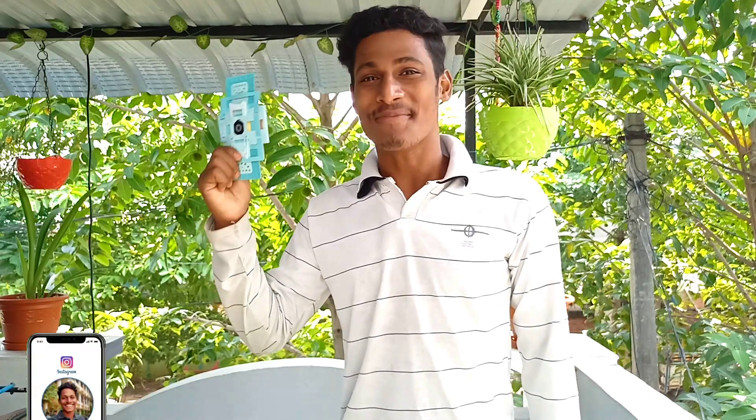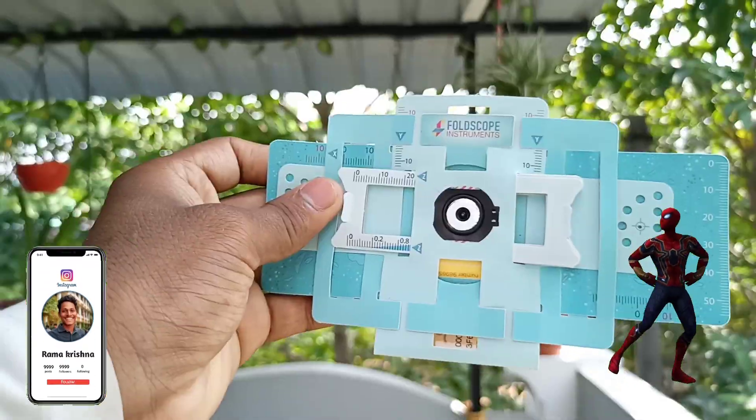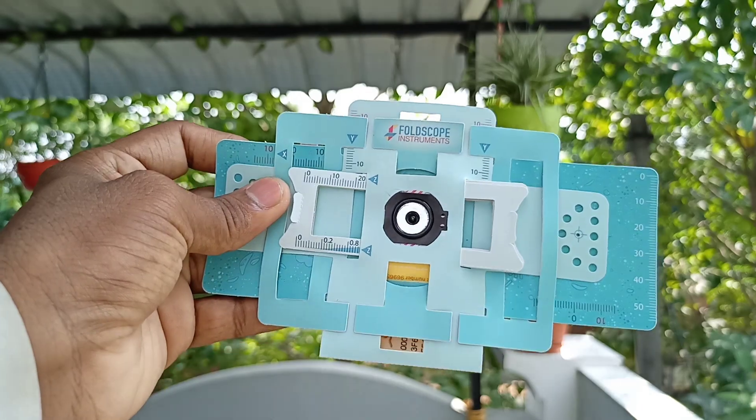The thing I am holding in my hand is a microscope — yes, it's a microscope. It works like a conventional microscope and it's 99% cheaper. It was invented by Indian scientist Manu Prakash at Stanford. It is called the Foldscope.